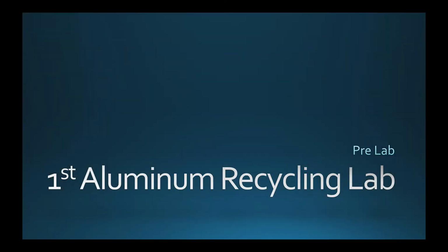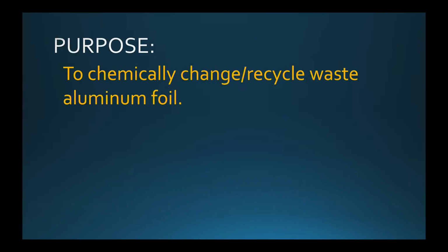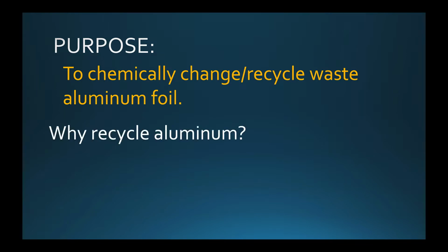During this video, we will be completing the first aluminum recycling lab. The purpose of this lab is to chemically change or recycle waste aluminum foil. Why should we recycle aluminum?